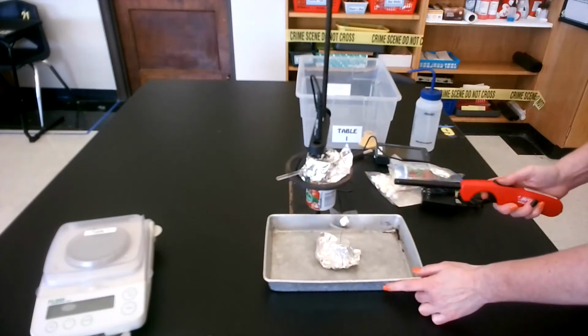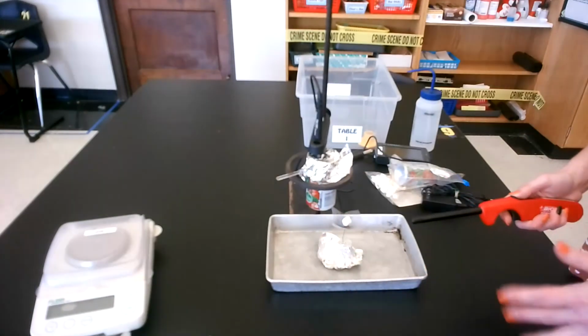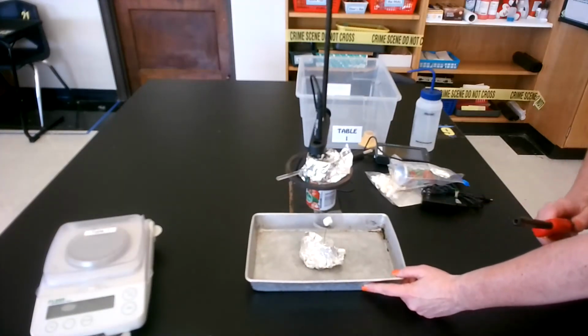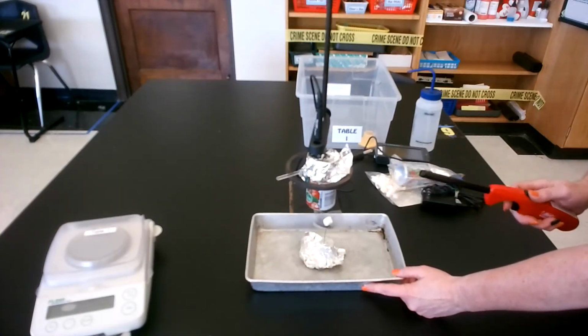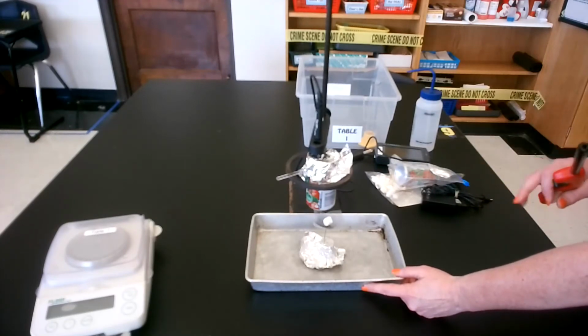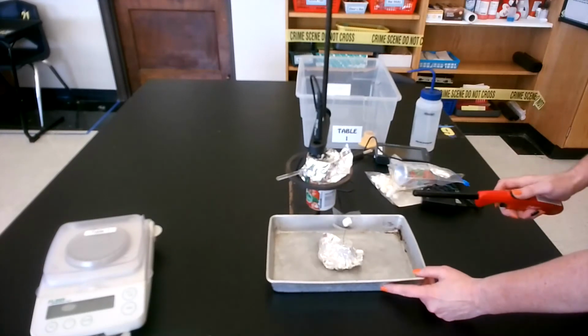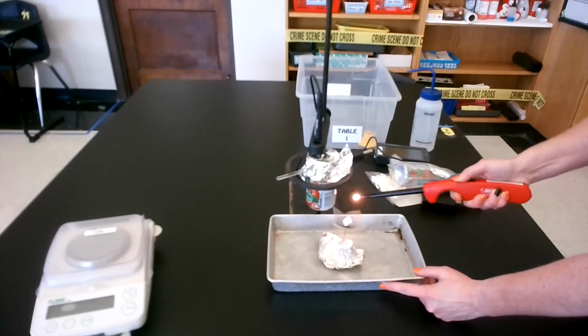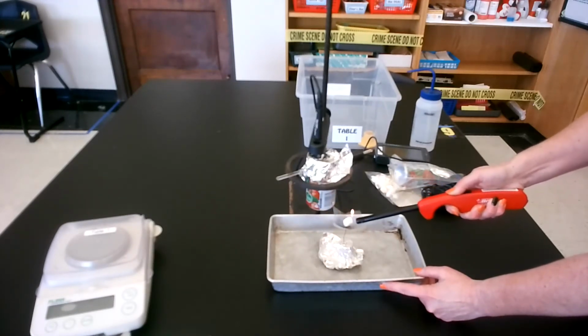There we go. So I'm going to light it. When I see that it's lit, burning, smoke coming off of it, then I'm going to quickly move it under my can. When I see that it stops burning or there's no smoke, then I'm going to move it back out and relight it. So you may have to go on top, just check it every once in a while.